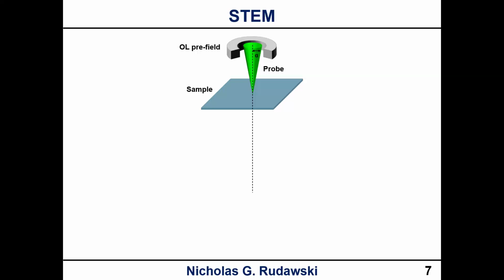When you have a very small depth of field, like with 20, 22, 25 milliradians, they will use that as a way to probe within a material and focus on a certain plane. If that angle is a lot smaller, about 10 milliradians for a non-corrected tool, you're not doing that to the same degree.